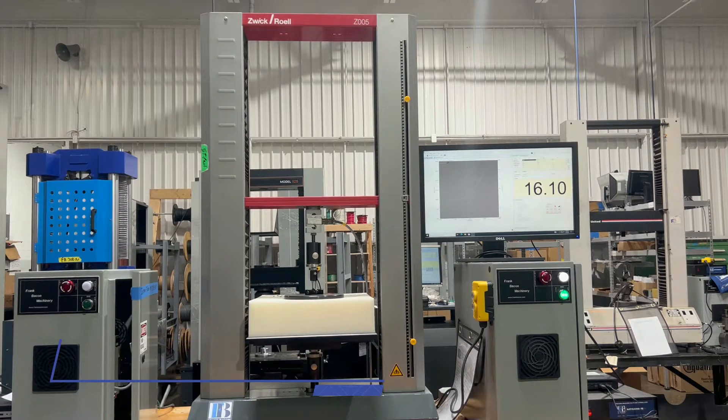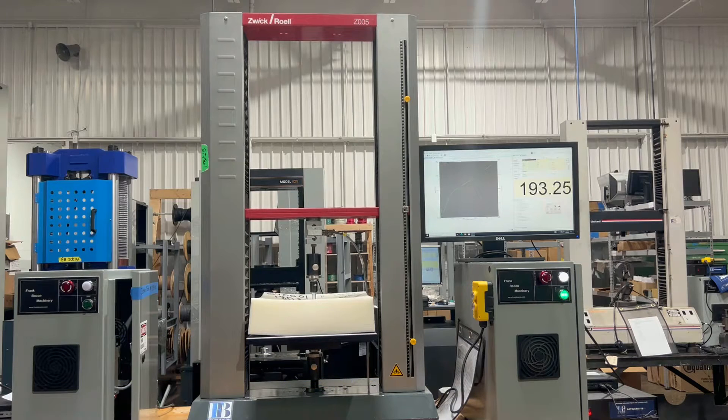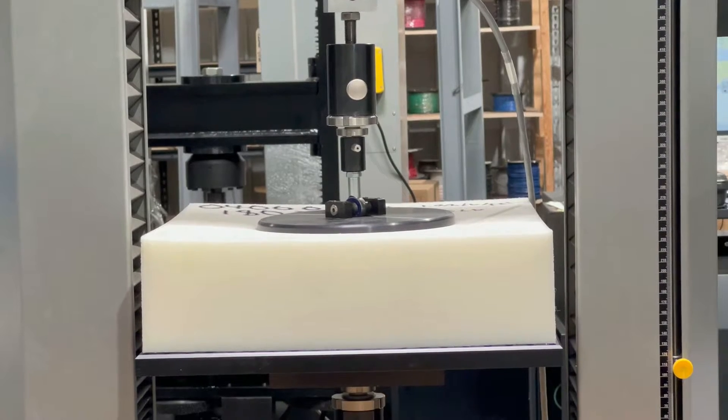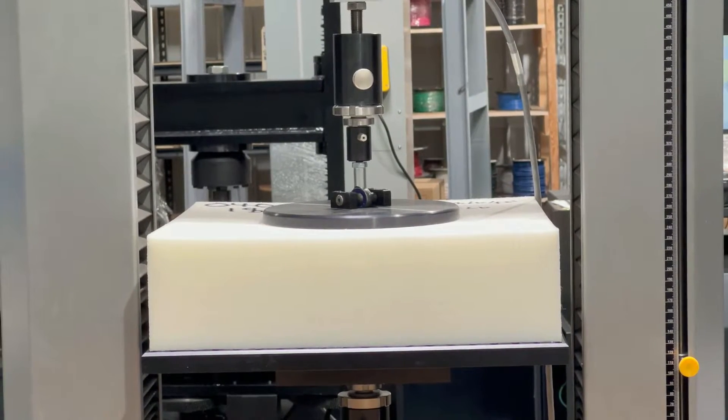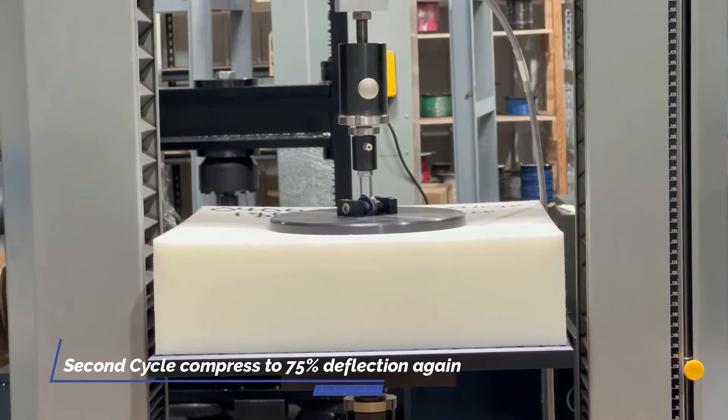Our top platen is coming down, making contact. It's now moving down to 75% deflection. Reversing and returning to zero. And we'll do that for one more cycle. There it goes for the second cycle.